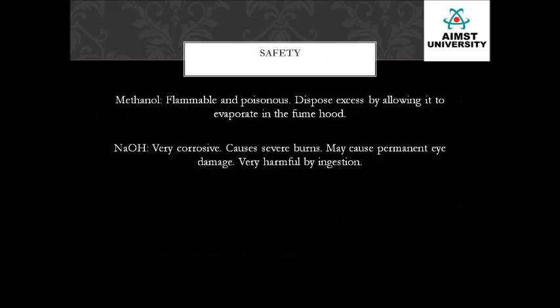Safety precautions to be taken during the synthesis of biodiesel. Methanol is flammable and also poisonous. Dispose excess by allowing it to evaporate in a fuming cupboard. Sodium hydroxide is very corrosive, causes severe burns and may cause permanent eye damage also.